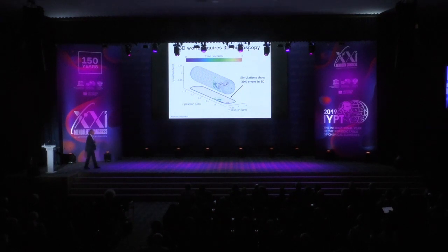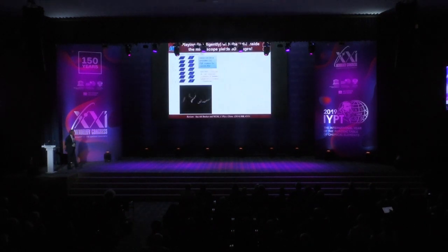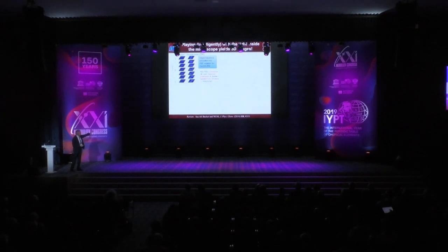So we've been working on techniques for 3-dimensional imaging, and here's one of them. This is going to be a bit of a mind bender for some people. On the left is a standard microscope where all I'm doing is I have a single emitter and I'm moving it to different Z positions, and you see it's in focus at one time, but then it goes out of focus and it disappears very quickly. That doesn't help you very much.